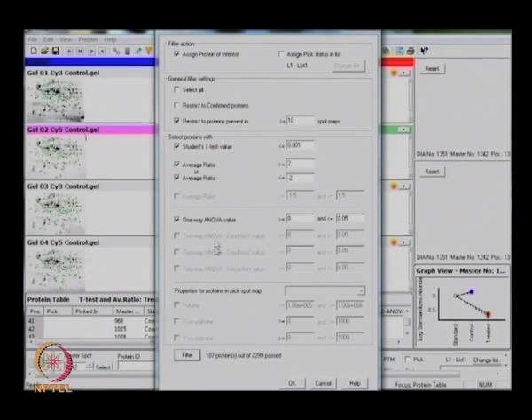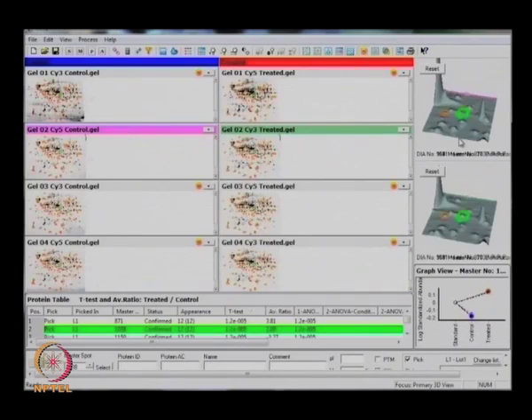These parameters we can select as proteins of interest and assign a pick list, so that these proteins can be saved in a file. This file can be given further to our spot picker. These are all things we can identify very easily in BVA. This is very user friendly. There is not much manual interference. Okay, this is what helps you to analyze your DIGE gels.